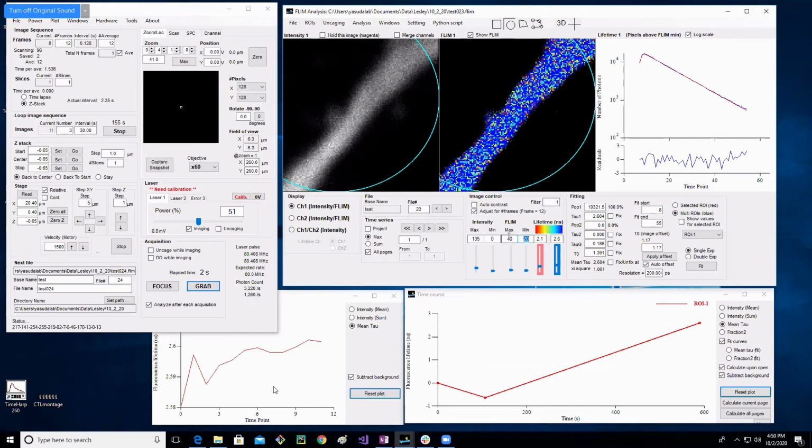If I change it dramatically, I get less of a neuron. You can start to see I'm actually losing a lot of photons here. Before, my curve went all the way up, like where this red curve is, and now it's dropped down.